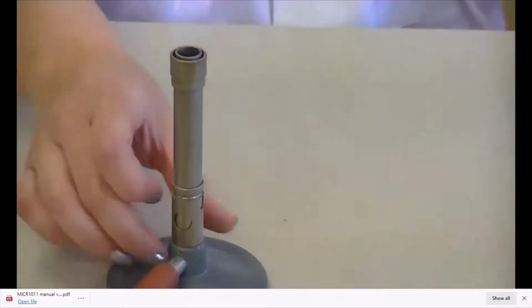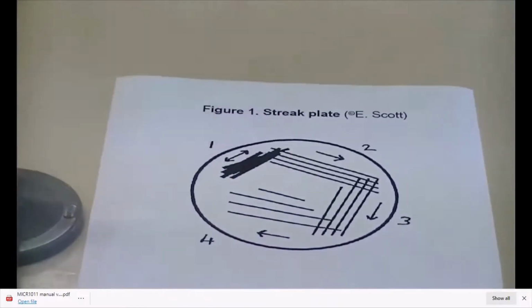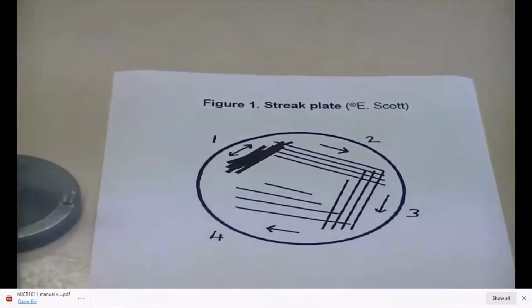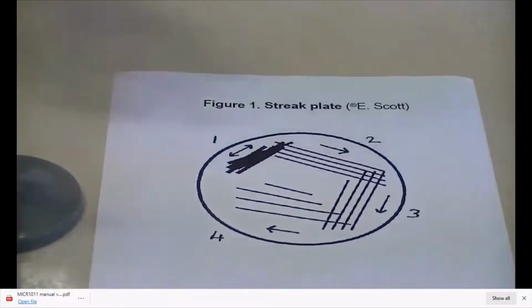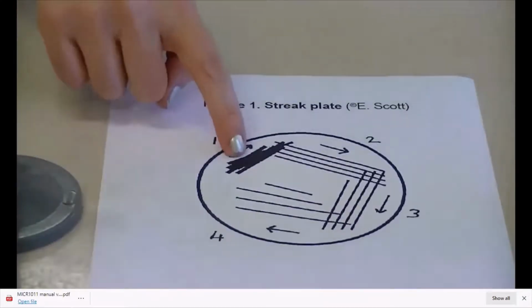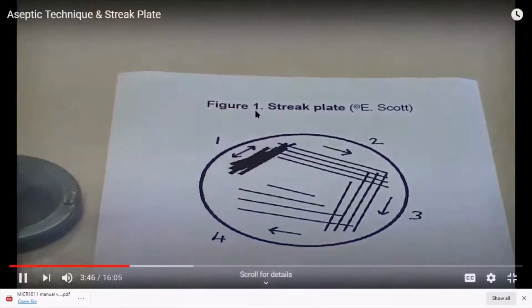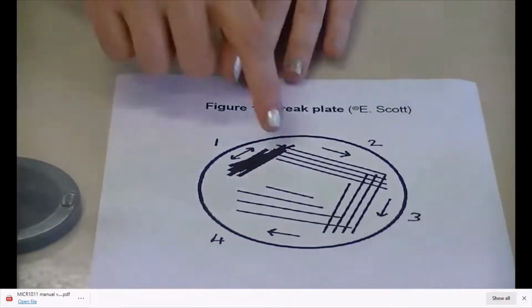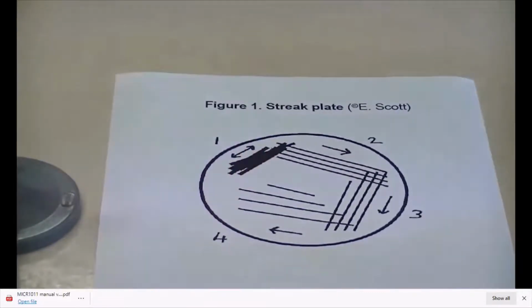The streak plate technique is actually shown in a diagram in your manual. So this is figure 1. To perform the streak plate technique, it requires you to use a sterile loop and to transfer some bacteria or yeast onto a plate, and then to continue streaking it. Basically the purpose of the streak plate technique is to dilute the number of cells, so that when you get to your quaternary lines, you should have individual colonies.